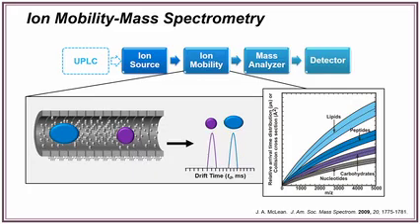So when you combine that with the mass spectrometry information, the mass to charge information, you can have these really lovely organized representations of your data in two-dimensional space where you see these trend lines for the different types of biomolecules. And this is because there are certain inter- and intramolecular interactions in the molecules that give them their shape. There are certain building blocks that they all have in common, right? So there are only a certain number of peptides, and proteins only expand in a certain dimension, and they have a particular shape, right? Same thing for lipids.